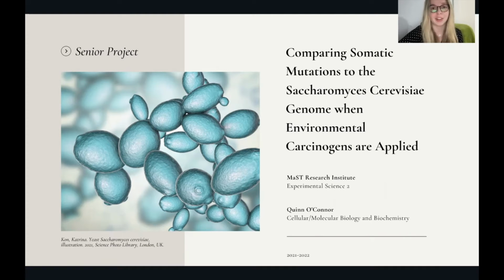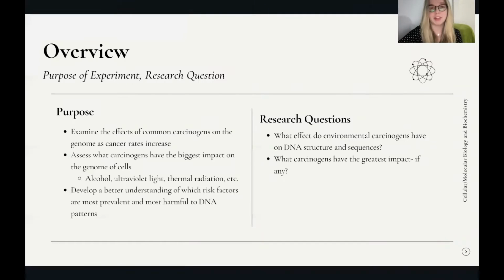I'm a senior at Sarasota High School, and for my senior project, I will be comparing somatic mutations to the Saccharomyces cerevisiae genome when environmental carcinogens are applied. So the purpose of my experiment is to examine the effects of common carcinogens on the genome as cancer rates increase, using yeast as my cell.